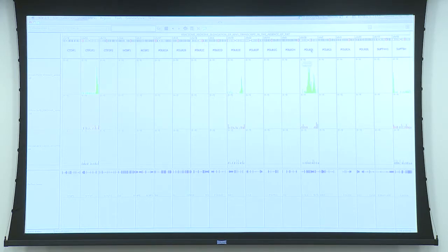So you see some of them are on chromosome 19, so we do see peaks on the promoters of these genes, and some of them are not, and that's why we don't see anything. But it's really nice to see that we can see many, many genes at once, and you can define it and so on. And again, I totally encourage you to go into the instructions and the interface of IGV to explore it more.